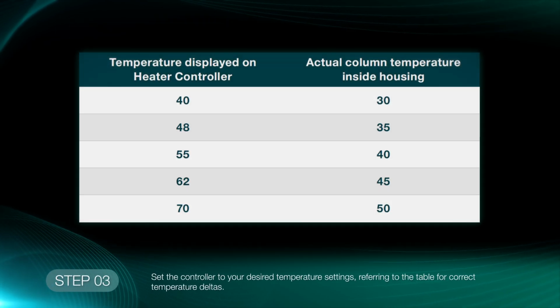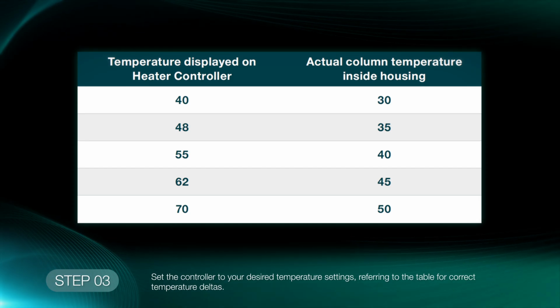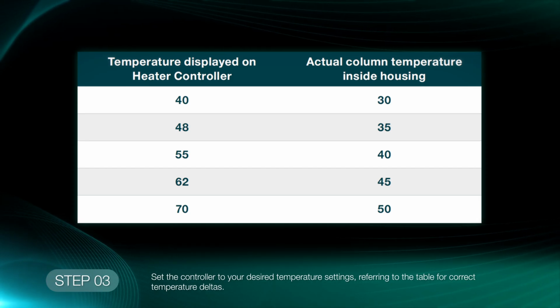Set the IonOpticks Heater Controller to your desired temperature settings, referring to the table for correct temperature deltas required for use with the HeatSync Rapid column housing.